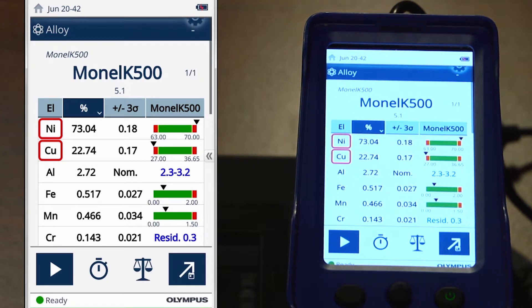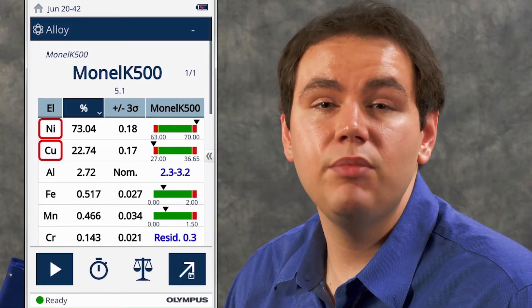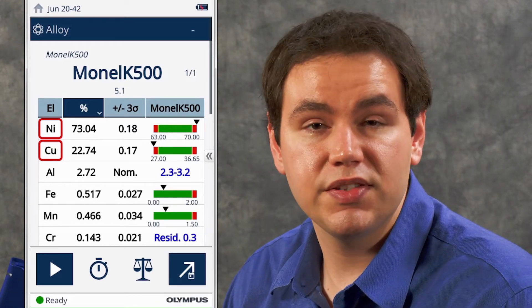Looking at the chemistry, we can see that nickel and copper are outlined in red. This outline indicates that they are outside the specification range for Monel K500. This is why we initially obtained no match — our sample is out of spec. The red outline allows you to quickly see which elements are causing your sample to fall out of spec, and to make any process changes needed to correct this.